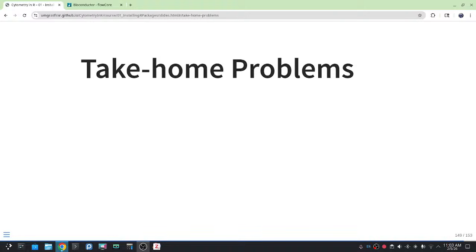And then the take-home problems are optional. You don't have to do them. All this material I provided today has been pretty carefully curated. You may find an occasional bug here and there, but you're pretty much on a guided tour. A lot of the learning process, as far as building your own mindset of how to work with code, how to adapt and troubleshoot code, takes a little bit of trial and error. So this is particularly good if you're trying to work with your own data sets.